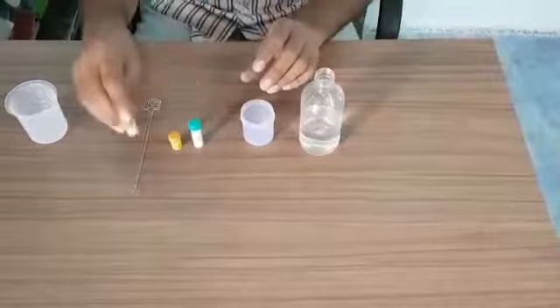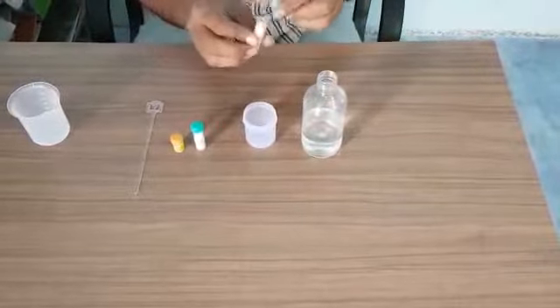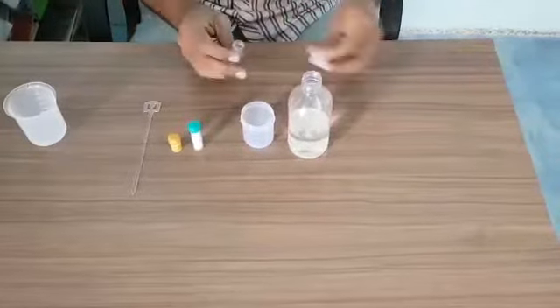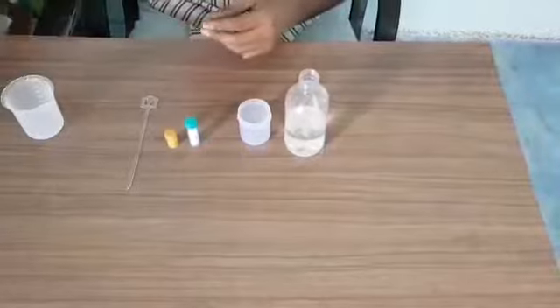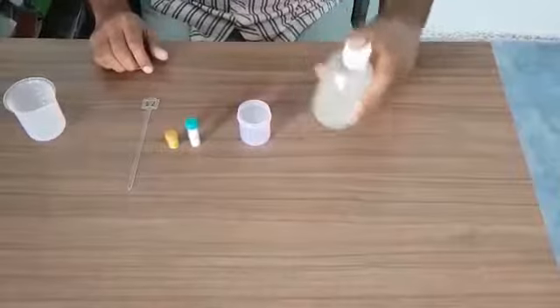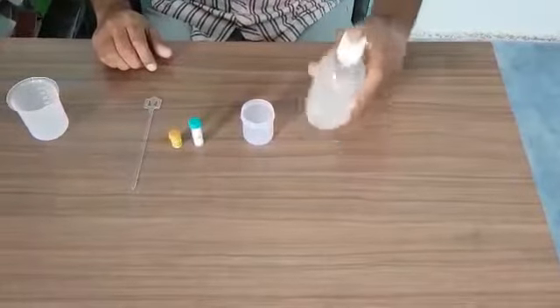Now we will add this sugar — full sugar into this. It is approximately 4 grams of sugar. Put the lid and shake the bottle so that the full sugar will get dissolved.